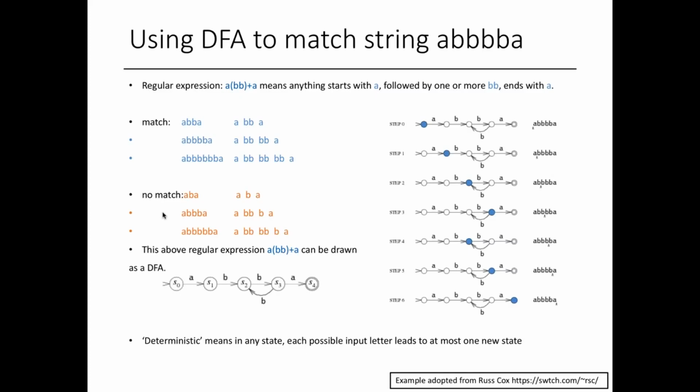We want to see if this actually improves our identification. This was developed together with a new algorithm that uses a DFA, a deterministic finite automaton. The DFA is how, in computer science, a regular expression is searched against a string.